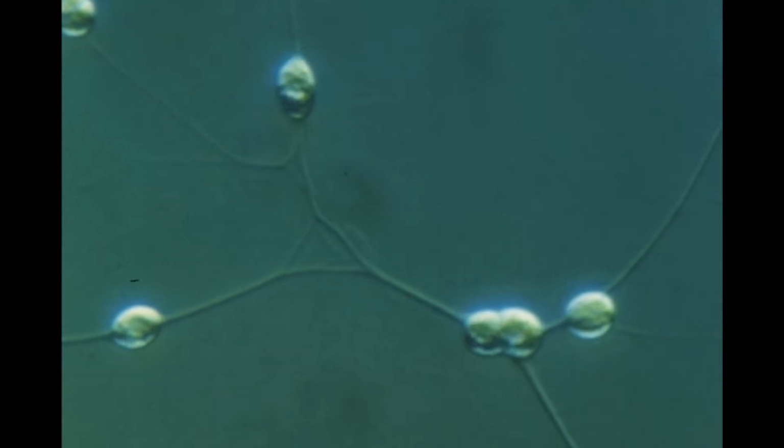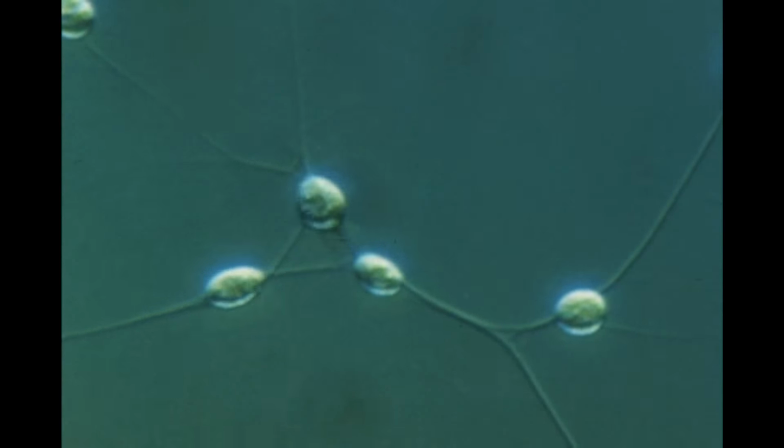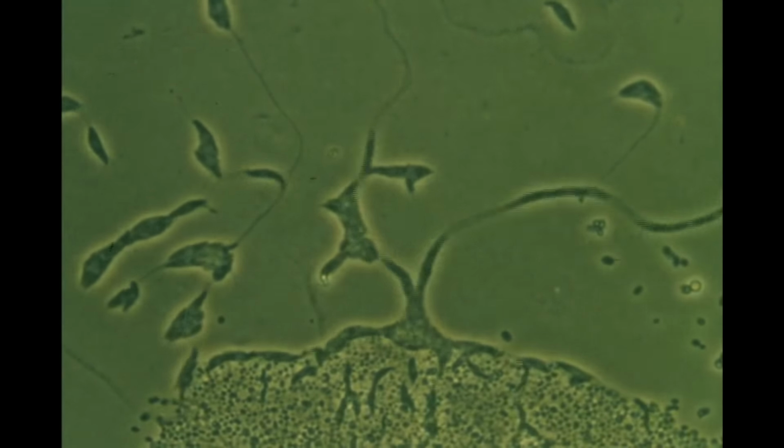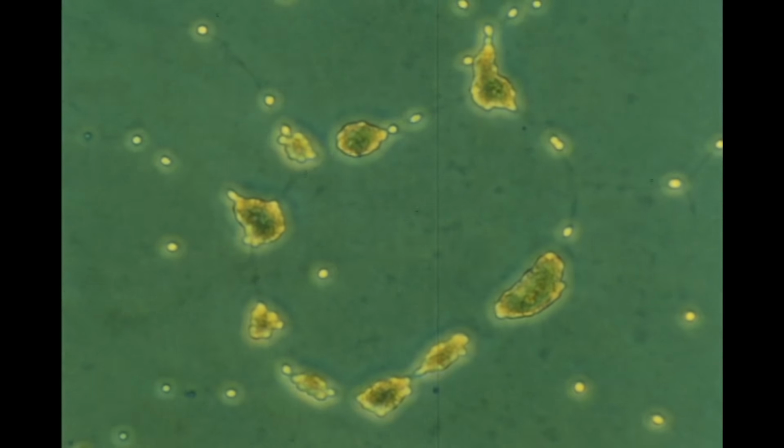Simple colonial organization in Labyrinthula is exhibited by cell motility within a preformed extracellular network, movement directed toward a food source, and primitive aggregation of cells.